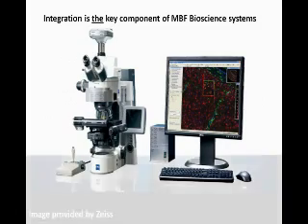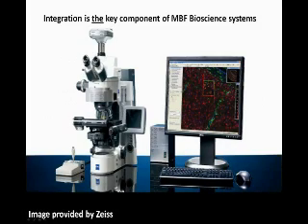Integration is the key component of MBF Bioscience systems. We've got new cameras, new scopes, new illumination methods, and they're all pretty awesome. And not only that, but we make them play nicely together. That's just what we do.